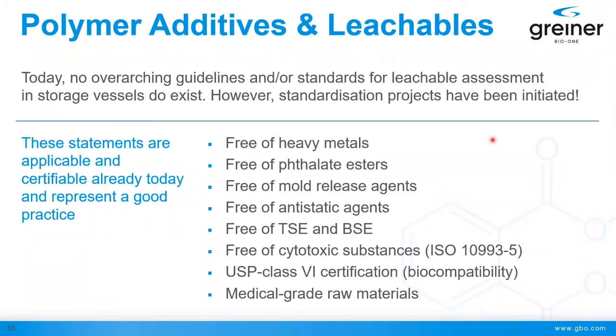Even in medical devices, the whole science and understanding is not really very advanced, but we also see that there's a lot of discussion and the world is changing. I would not be surprised if soon we would have better regulation and standards which allow for a good understanding of what is in these products and what could leach out.